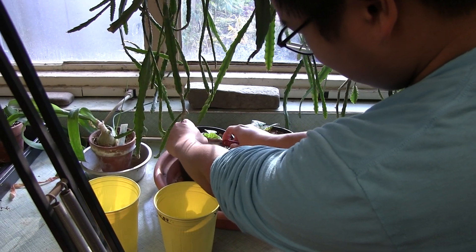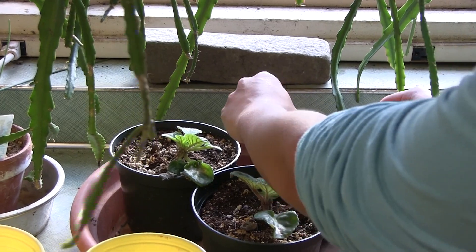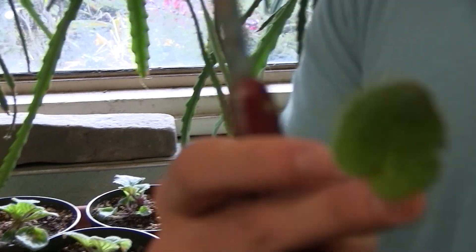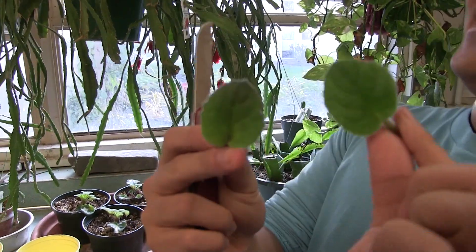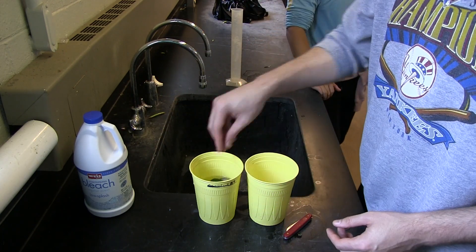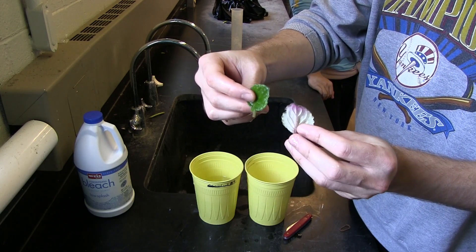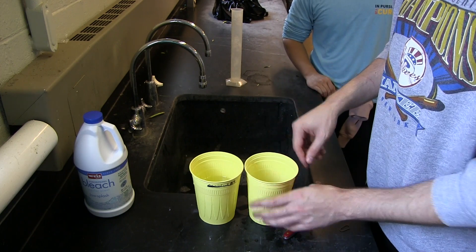Cut your African violet at the petiole to obtain your explant for tissue culture. Create two solutions: one of a soapy water mix and another of 10 percent bleach solution. Wash explants first in the soapy water mix, then disinfect by letting the explant soak in bleach solution for 15 minutes.